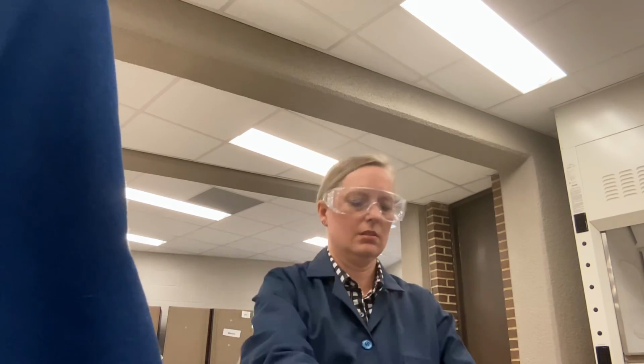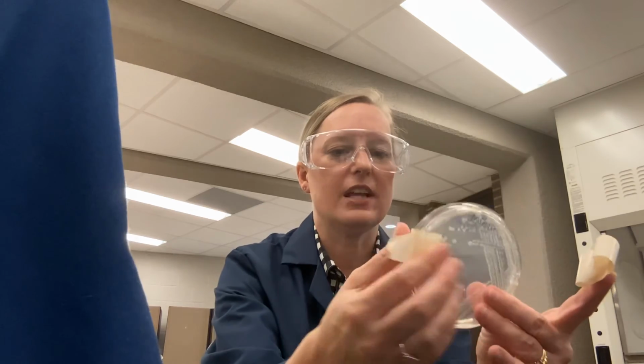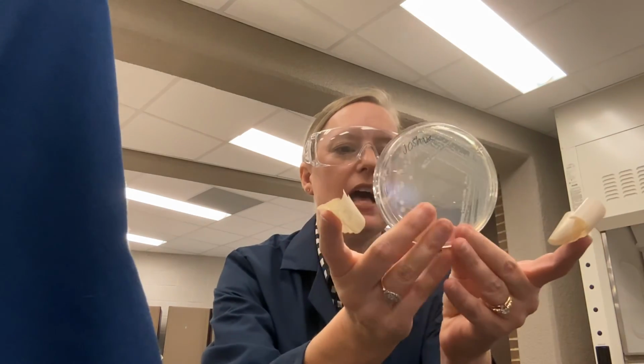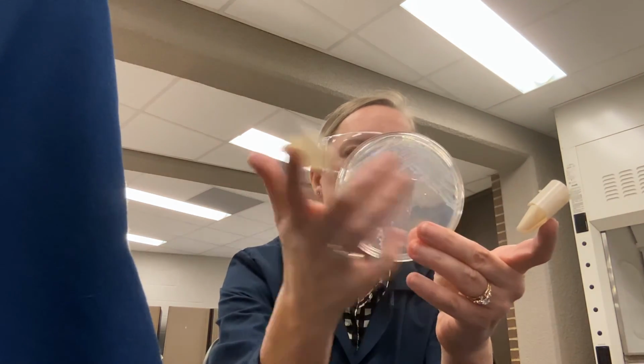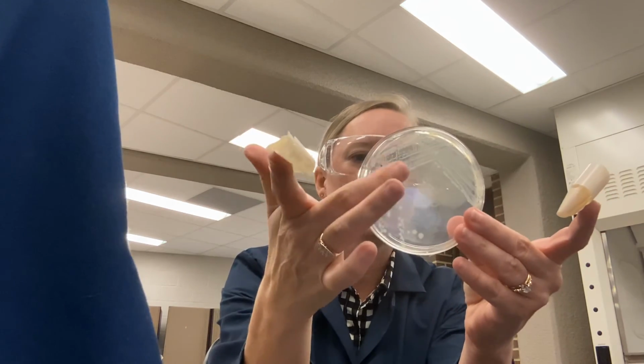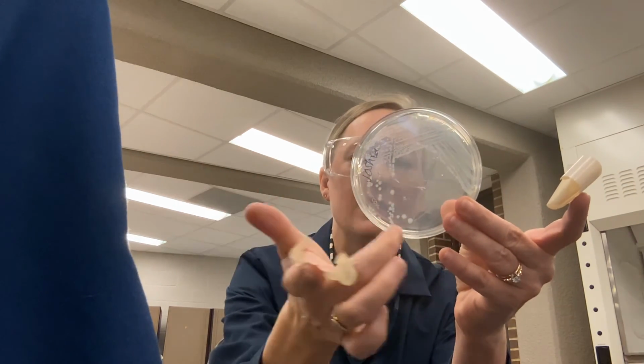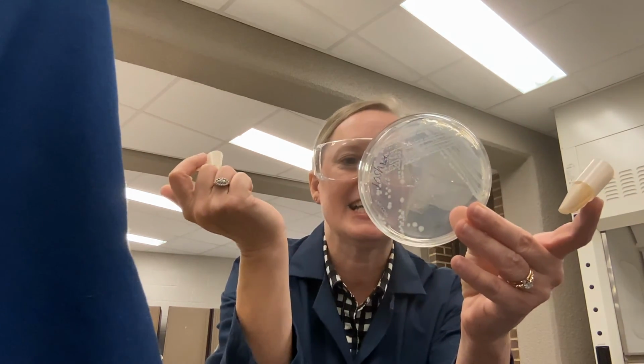Okay, so now I'm back, and we have the results. All the white are what we call colonies, that's growth. And you can tell where we were. This was zone 1, where we had lots and lots of growth. Zone 2 had a little bit less. Zone 3 had a little bit less. And then this is what we want: by the time we got to zone 4, these nice individual isolated colonies.